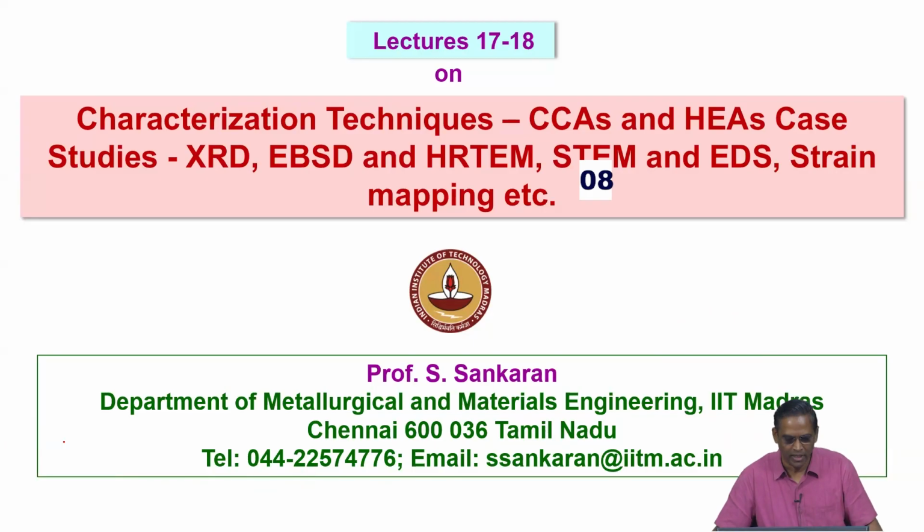Okay, good morning again, and we will start our lecture on characterization techniques on CCA alloys as well as high entropy alloys. In this lecture, I will demonstrate some case studies involving different characterization techniques like X-ray diffraction, EBSD, HRTEM, STEM and EDS, strain mapping, etc. If time permits, we will concentrate on strain mapping, otherwise we will postpone it to the next lecture.